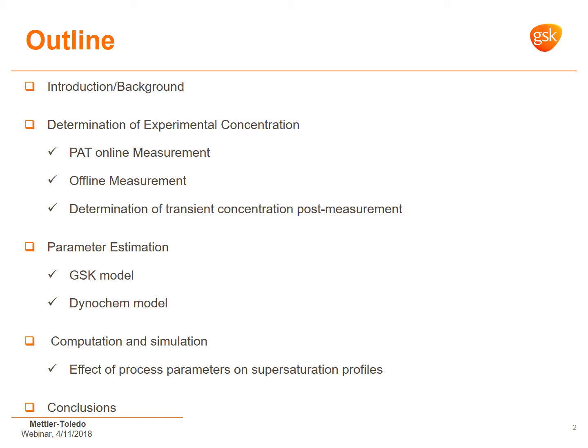We had some online PAT measurements, offline measurements, and also the method we used to determine the concentration of the salt. I will follow up with the parameter estimation. We have a Matlab-based model that we use, but we also worked in collaboration with Scale-up Systems to build a template for salt crystallization. I will finish up with some results from the computation and simulation, and conclude.